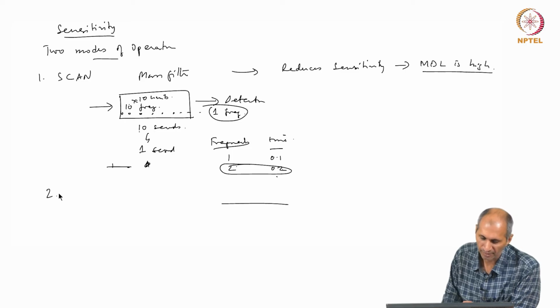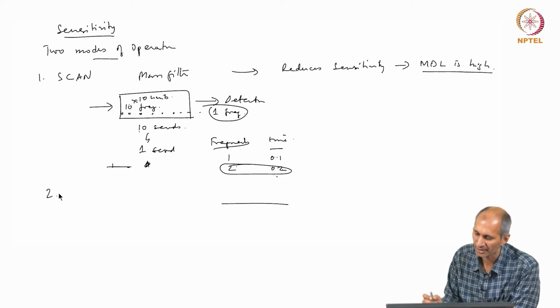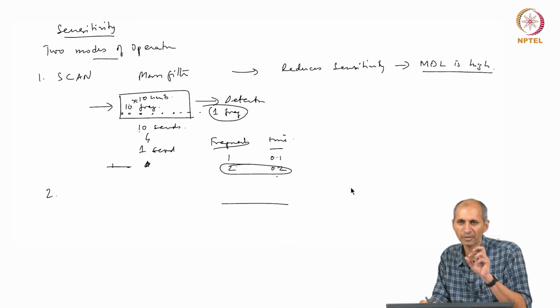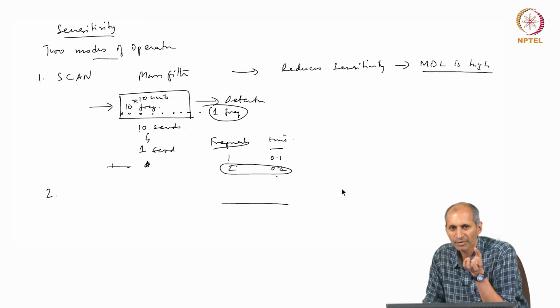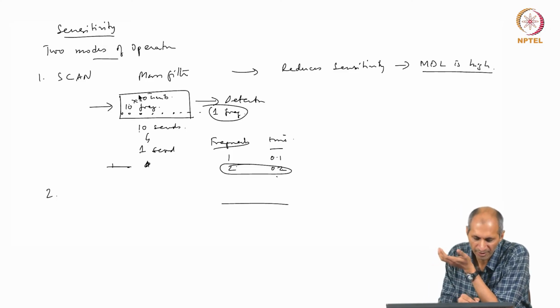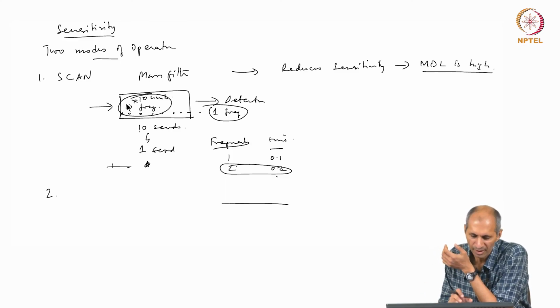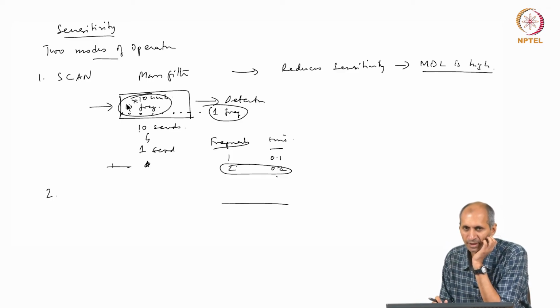So, the detector that we are using has an instrument detection limit below which it cannot measure. So, if I want to get above the detection limit of the instrument, I need to have enough concentration that goes to the detector. It is the same principle that we are using for MDL. So, we give the maximum opportunity for one particular fragment to go through the detector.